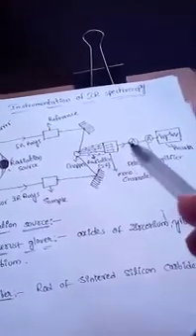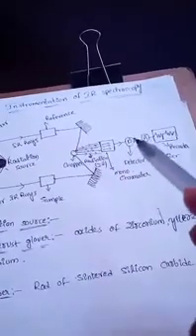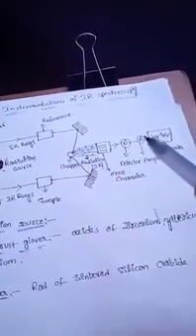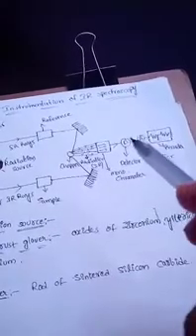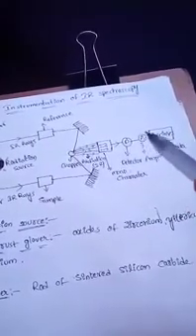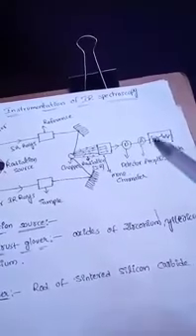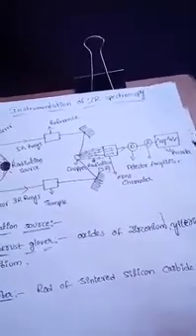This single ray moves towards the detector chamber. The detector detects the signals, and these signals move towards the amplifier chamber. The amplifier chamber amplifies the signal, and then this signal is displayed in the recorder component. These are the components used in instrumentation of IR spectroscopy.